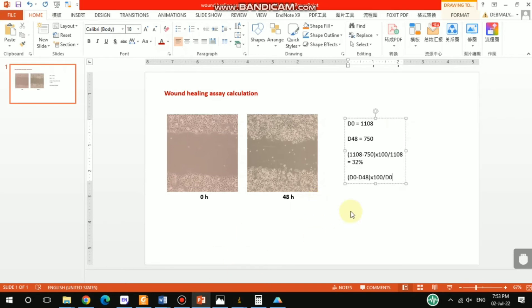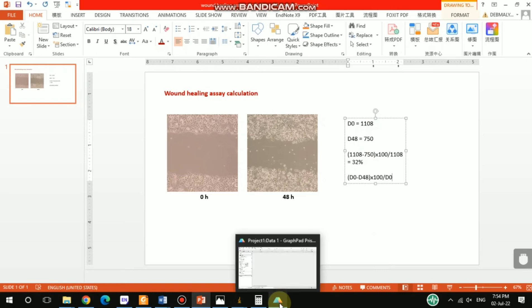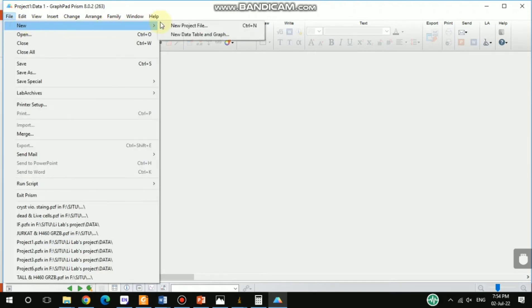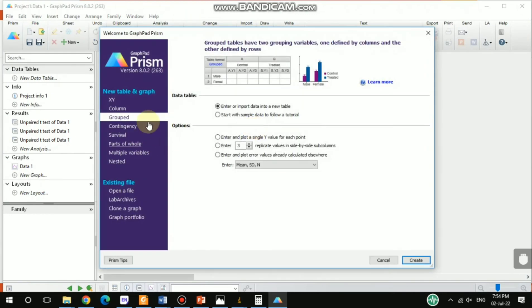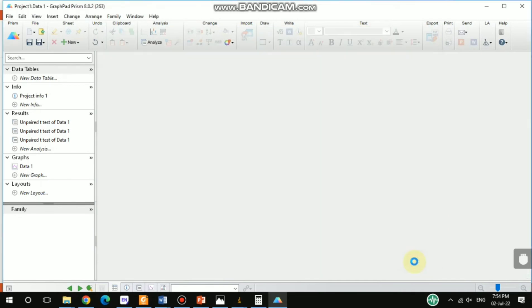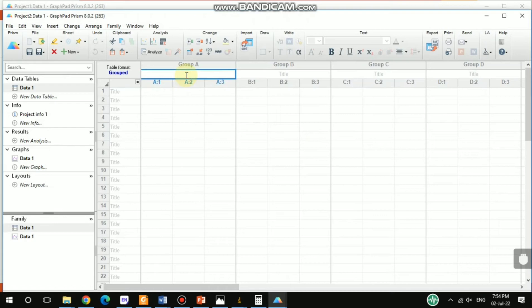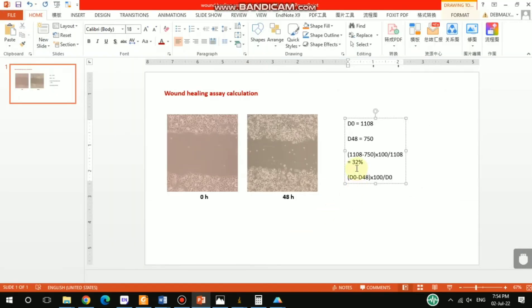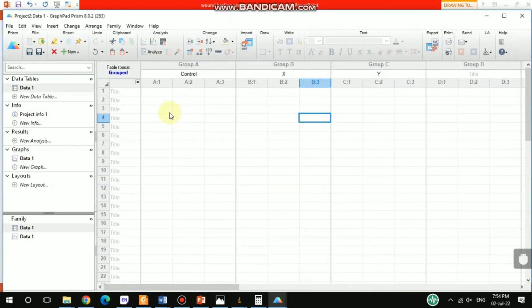For the statistical analysis, open GraphPad Prism, create a new project file, select Grouped, enter three replicates, and click Create. Let's assume we have a control group and two anti-cancer drug groups, X and Y. For the control group, one value I calculated was 32.